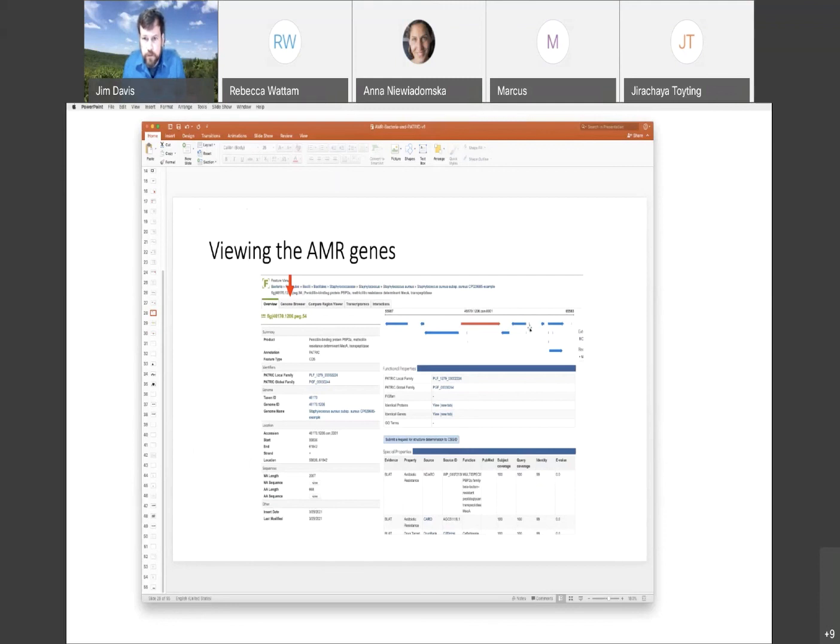You do have a question if you open up the chat. Do you know how to do that? Okay. Does PATRIC have an option to predict the structure of operons or genes associated with metal resistance? We don't have anything specifically for metal resistance. We also do not specifically offer the ability to predict an operon, but in the bacteria, you can kind of infer the operon structure with the genome browser or the compare regions tool.